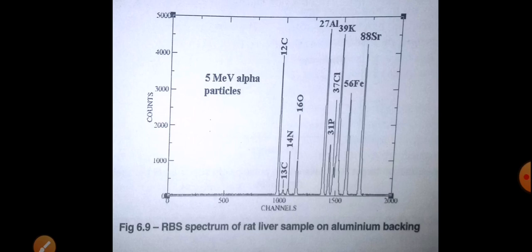This qualitative elemental analysis may have been done earlier. But quantitative analysis is done only here using RBS.